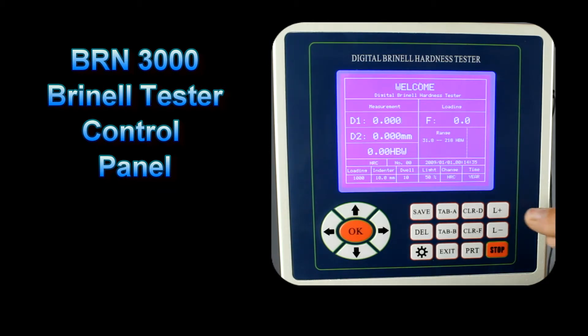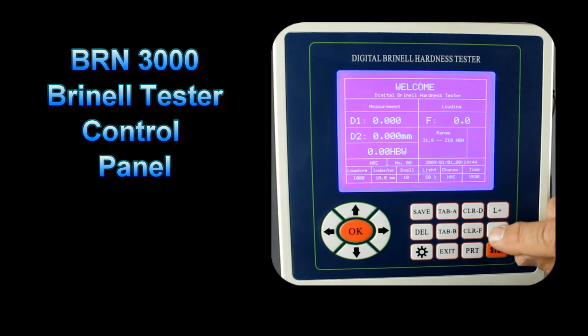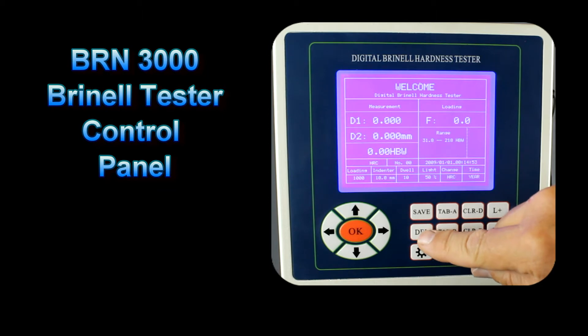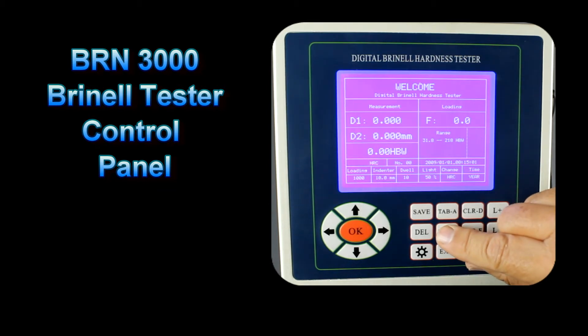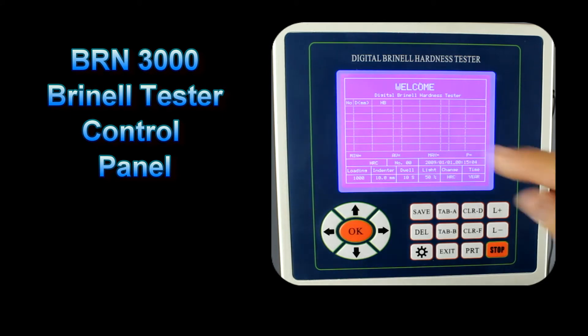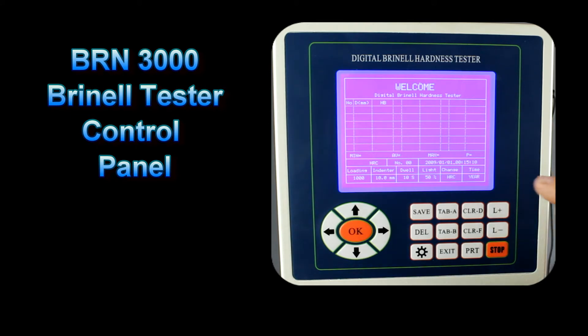When making a measurement, if we need more or less light, we don't have to go back into the main screen — we can just press L+ to increase the light intensity or L- to decrease it. After a measurement, if it's not acceptable, we can delete it by pressing the delete key. If all looks good, we can save the information. Going into the Tab B screen shows the results screen, where we can store up to 20 results across five different screens — one for each sample.